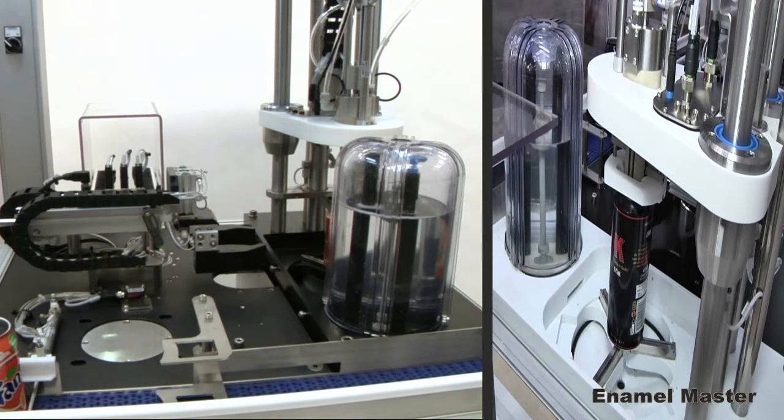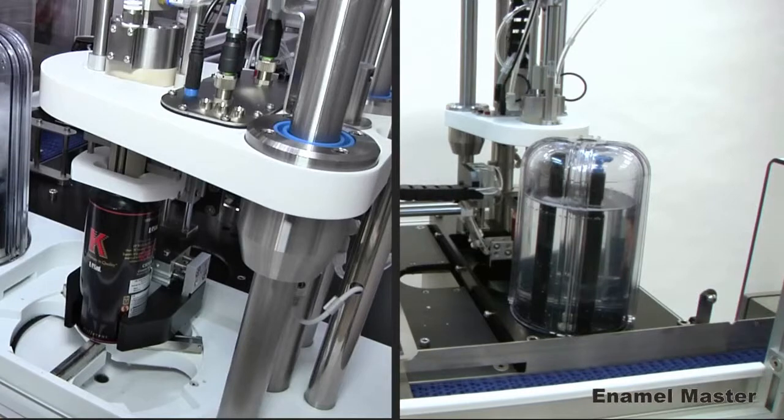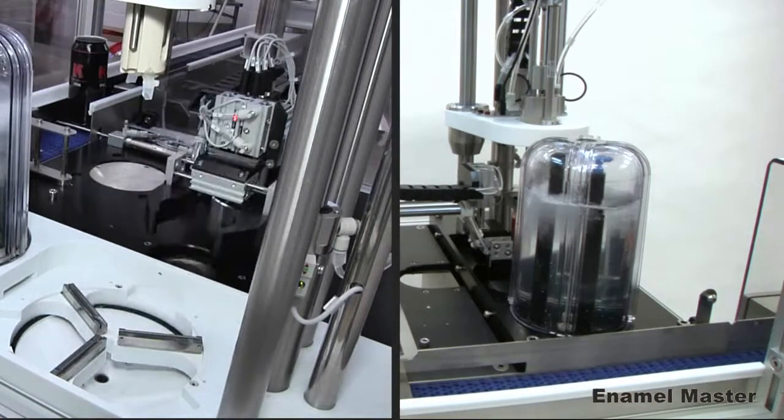Enamel Master checks automatically before and during batches for test integrity, electrolyte quality and test accuracy.